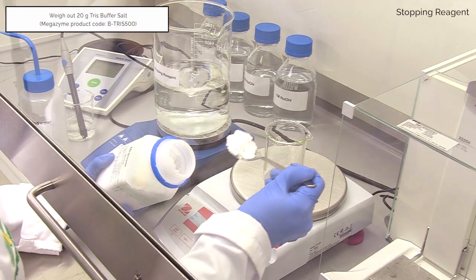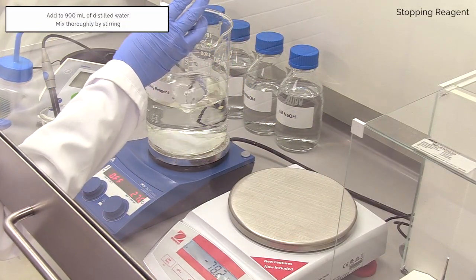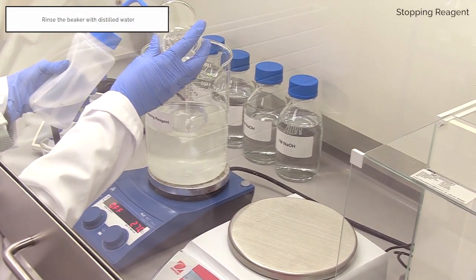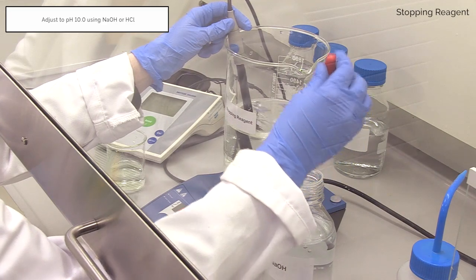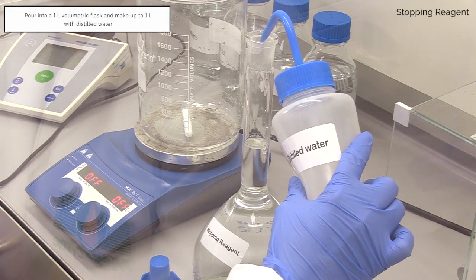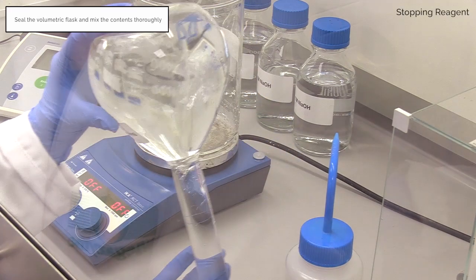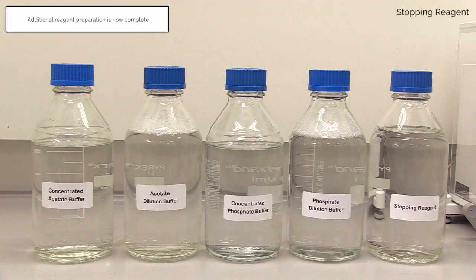Weigh out 20 grams of Tris buffer salt, B Tris 500, and add to 900 millilitres of distilled water in a stirring beaker. Check pH and adjust if required using 1 molar NaOH or 1 molar HCl to pH 10.0. Pour into a 1 litre volumetric flask and make up to 1 litre with distilled water. Decant into a 1 litre Duran bottle. This is stopping reagent. Additional reagent preparation is now complete.